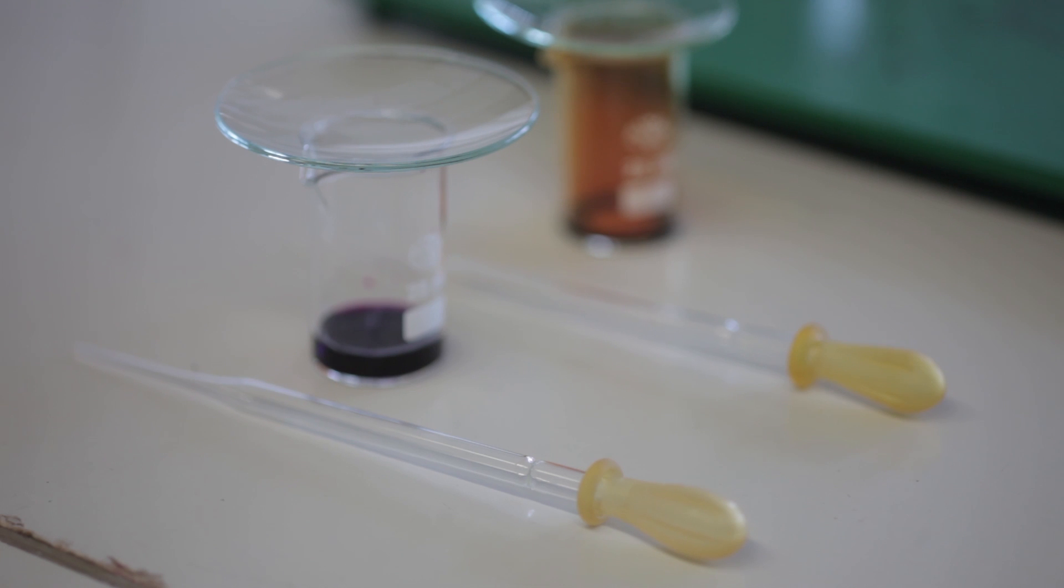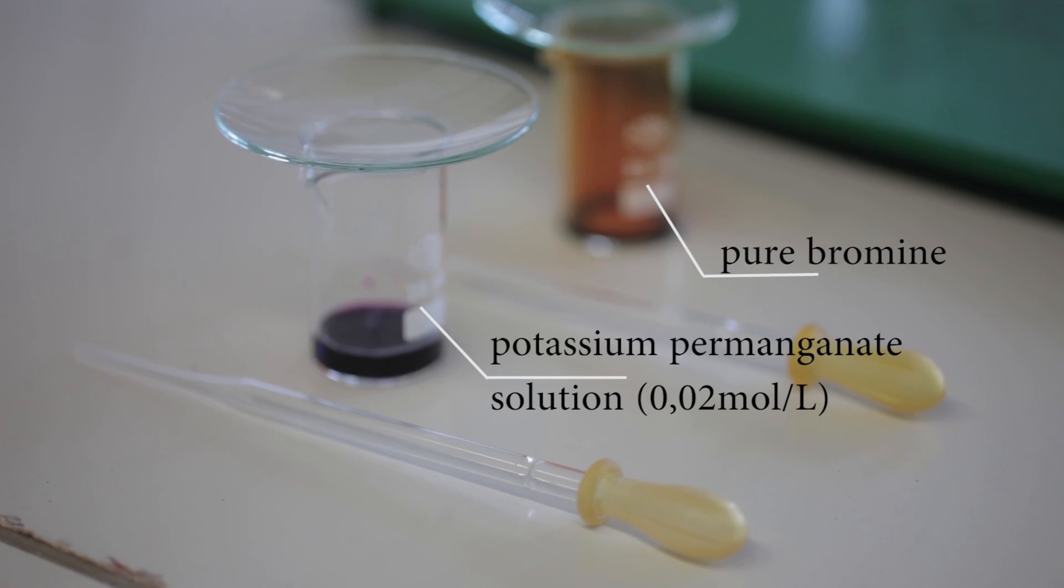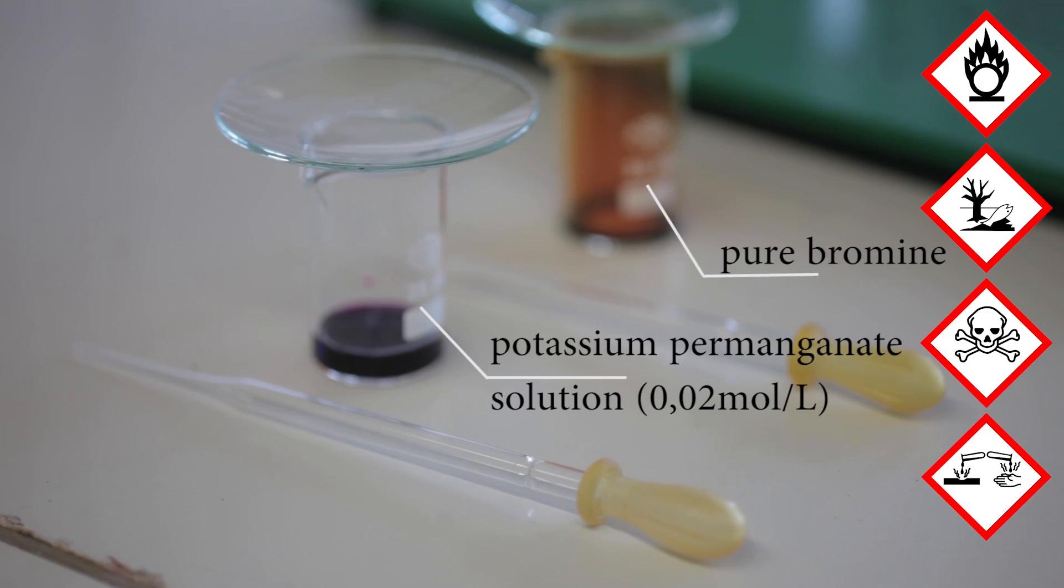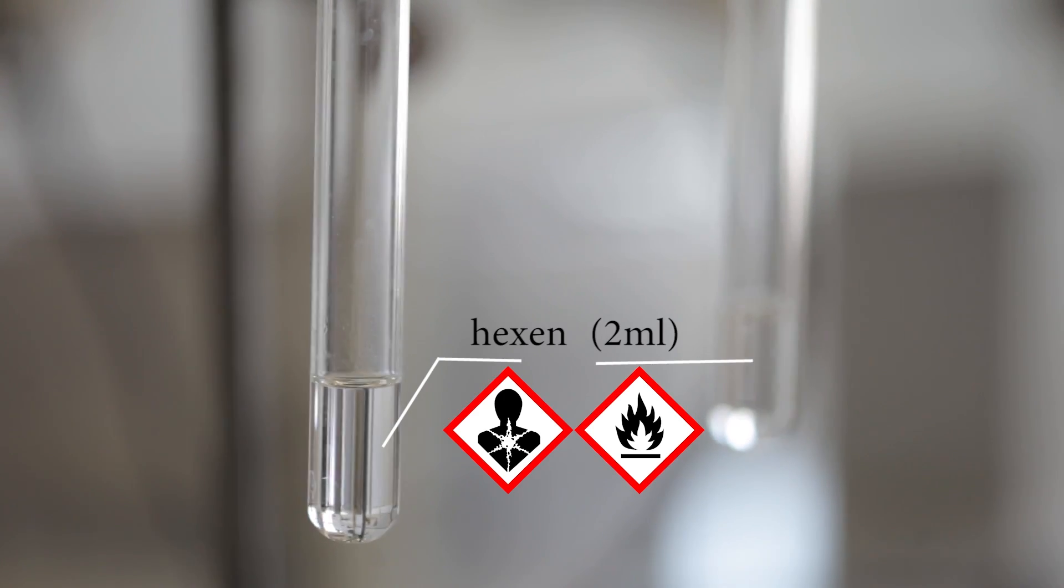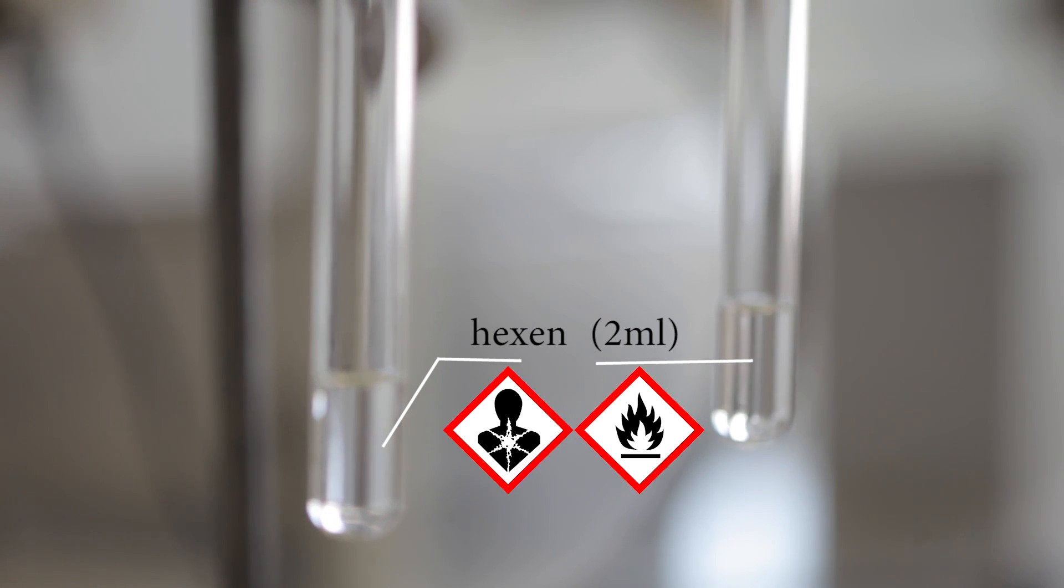For this experiment we need pure bromine, hexene, and potassium permanganate solution with a concentration of 0.02 moles per liter. The whole experiment needs to take place in a laboratory hood.